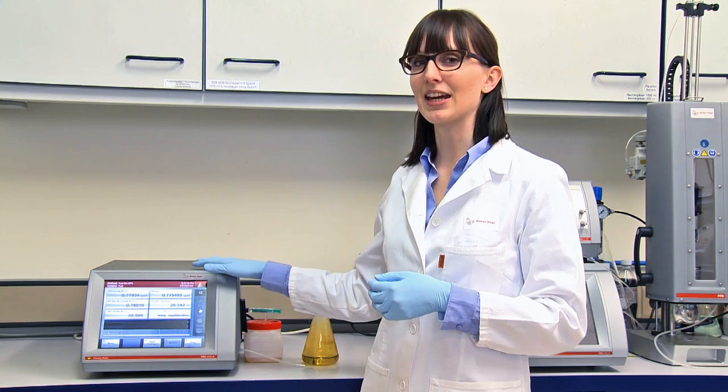This is DMA 5000M, the world's most accurate density meter. While traditional methods are time-consuming and your captain may already want to head for the next harbor, these other methods only provide accuracies limited to 0.1%. In contrast, DMA 5000M has an accuracy of 0.005%. This factor of 20 is of great value for your entire oil tanker.